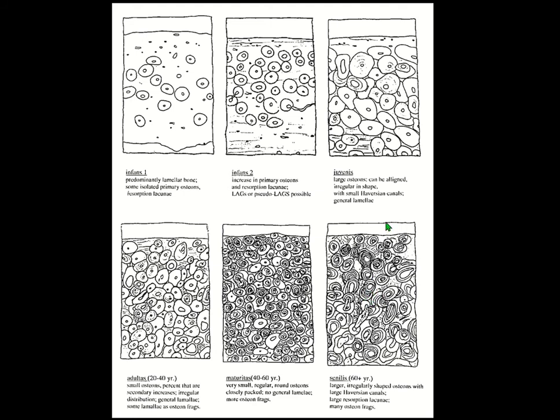And they eventually found out that you can, in fact, work out precisely how old an individual is by this technique. This is 60 years and older, and this is like an infant.